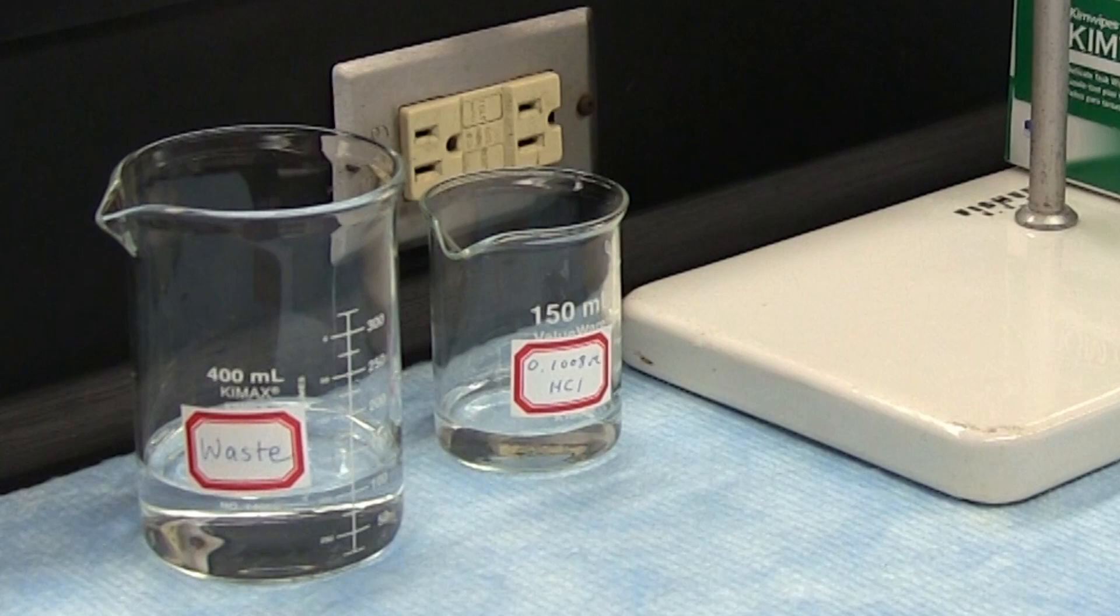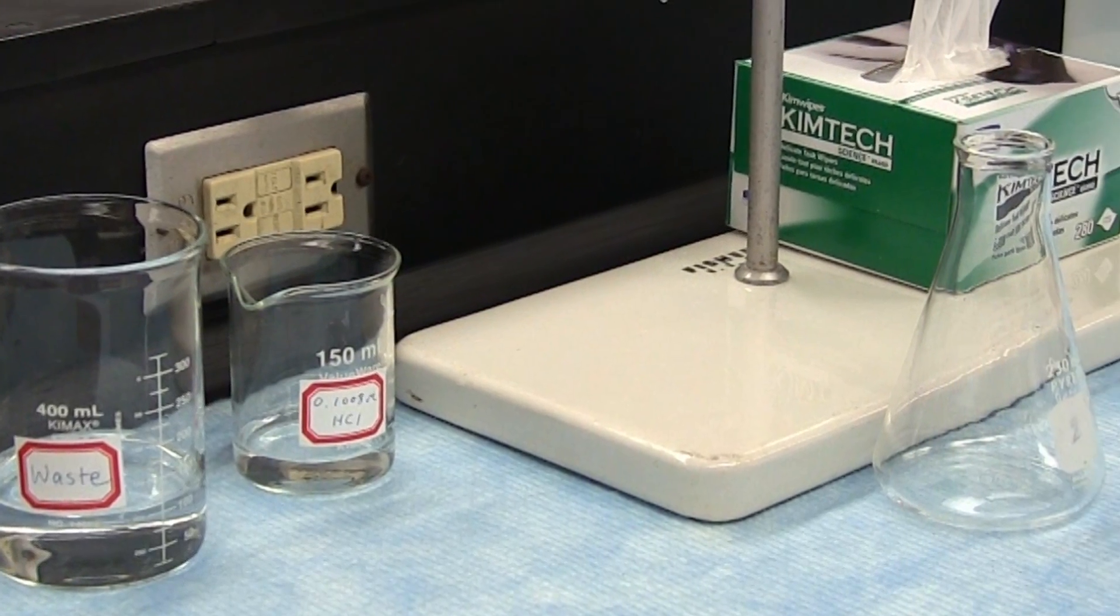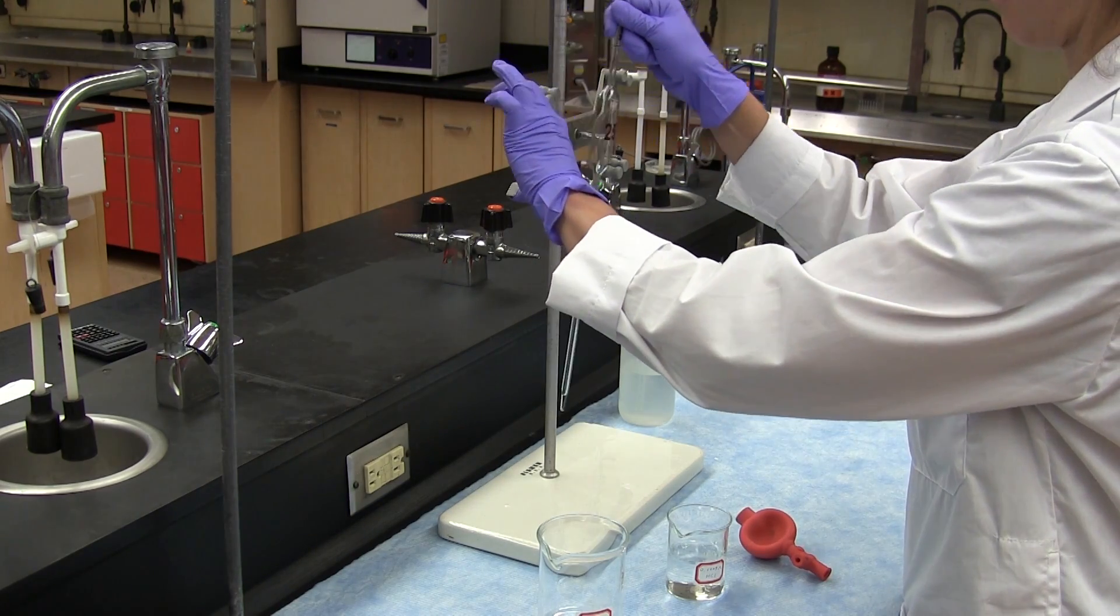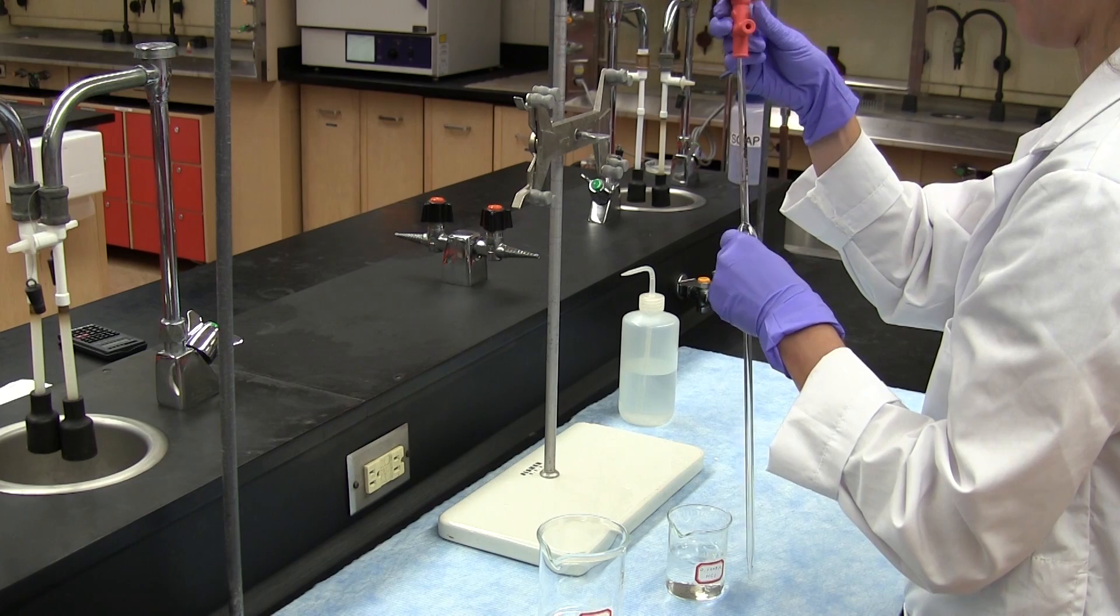We're going to transfer 25.00 milliliters of this standard solution to an Erlenmeyer flask. But first we rinse the pipette once or twice with the solution so as to remove any residual water from the previous cleaning.